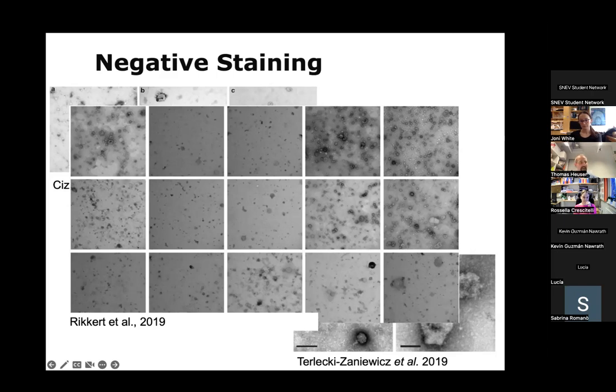On the other hand, what I could see is that with the glutaraldehyde, there might be a higher risk of forming some aggregates. So if you see huge clumps of your sample, then maybe it might be worth leaving it out and just trying it: how does the same sample look without? No, I tried, to be honest, a little bit, and I didn't see a big difference with or without.